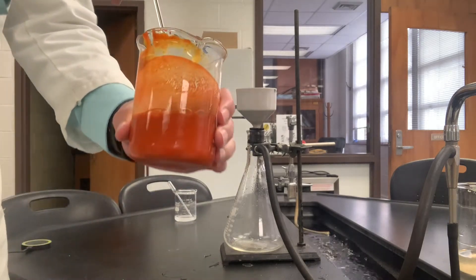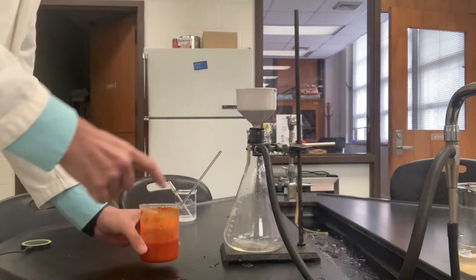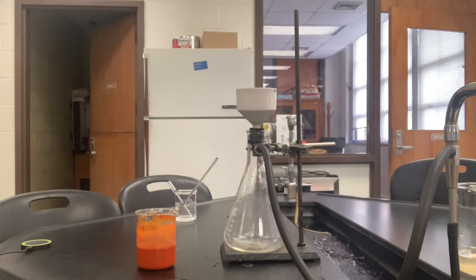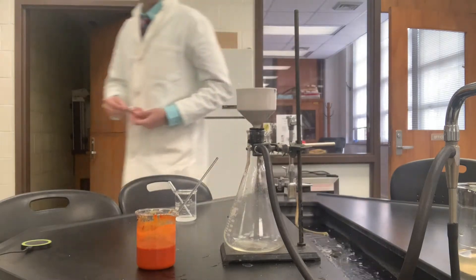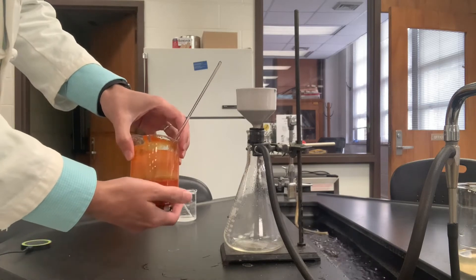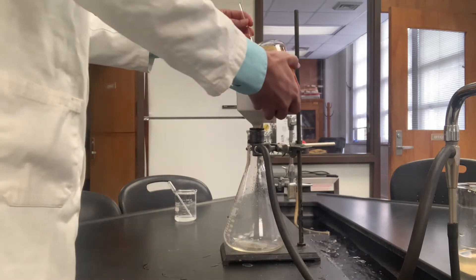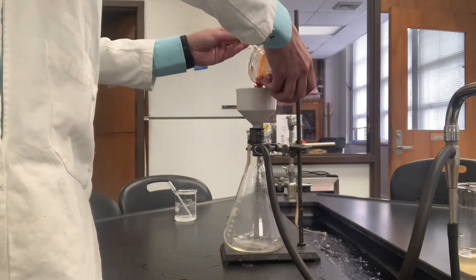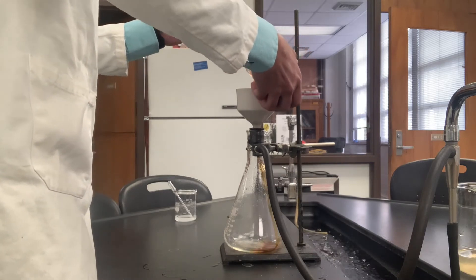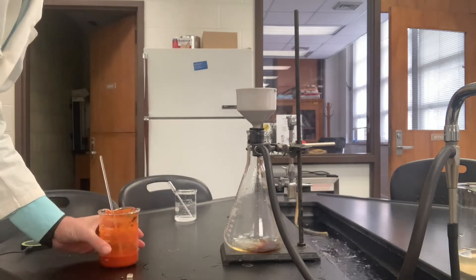That's a nice orange color, as it should be. We'll use a magnet to hold the stir bar on the bottom of this beaker so it won't fall in. It's a very thick suspension, and it takes a while for it to pass through the filter.